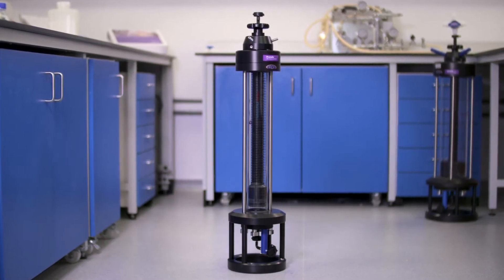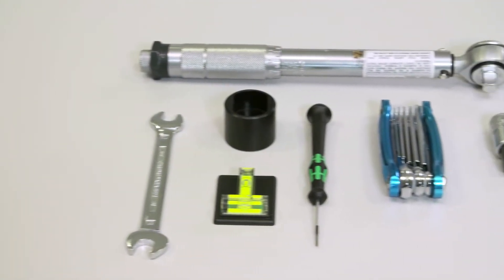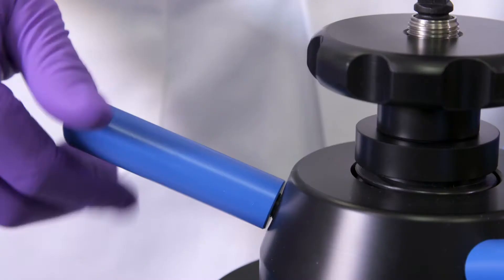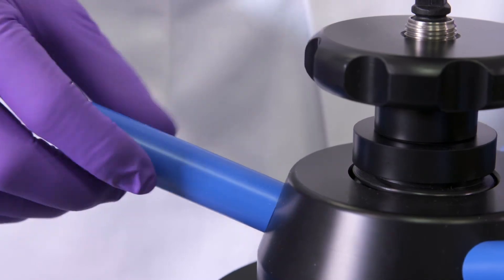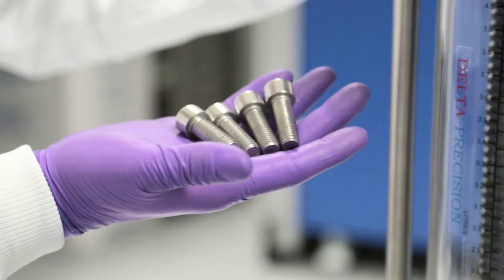Evolve columns are supplied ready to use along with an operating manual, tool kit, connection kit, and spares. Simply attach the height adjust handles, remove the fixing bolts with the tools provided, and you are ready to start packing.